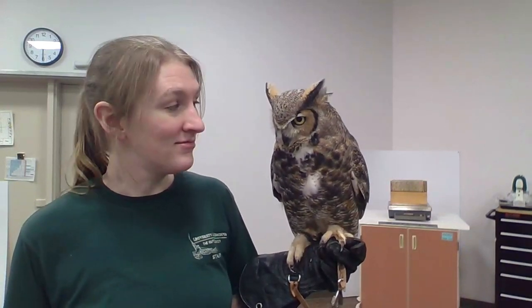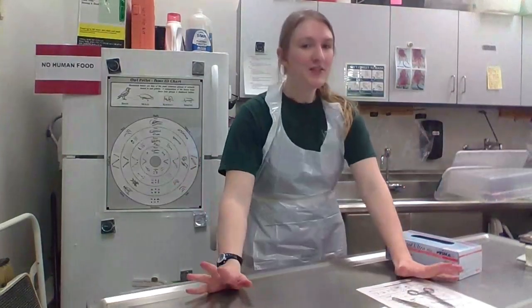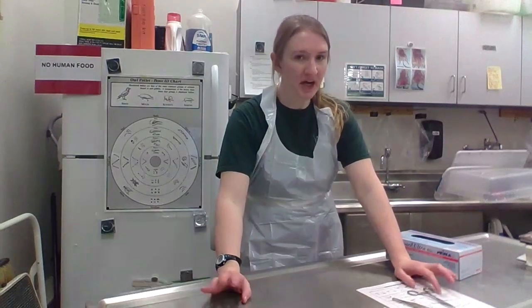And now, we wait. That food is going to go down into her stomach. It's going to take, again, about 8 to 12 hours for it to fully digest and form that pellet. She will cast up that pellet and then we're ready to dissect it. Now that we fed our owl a mouse, it's going to need to wait about 8 to 12 hours until it's ready to go, so find something to do.